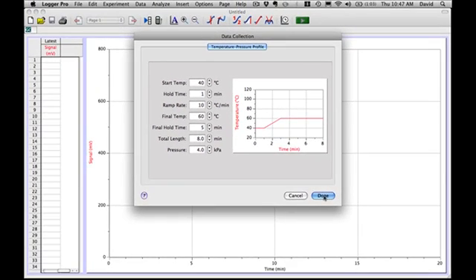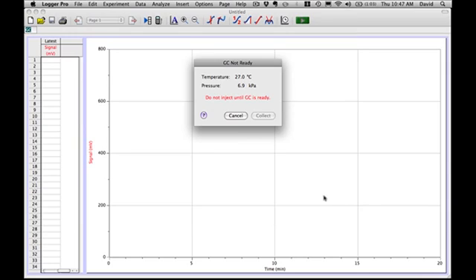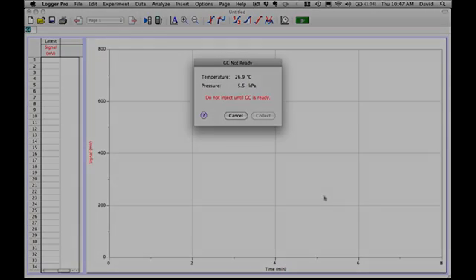Now that I've got my profile in place, I will click done on the computer and this warms up and sets the flow rate on the Mini-GC. It now says inject and click collect simultaneously, so I'm going to be ready to start the computer collecting data while Jack is ready to inject our sample.